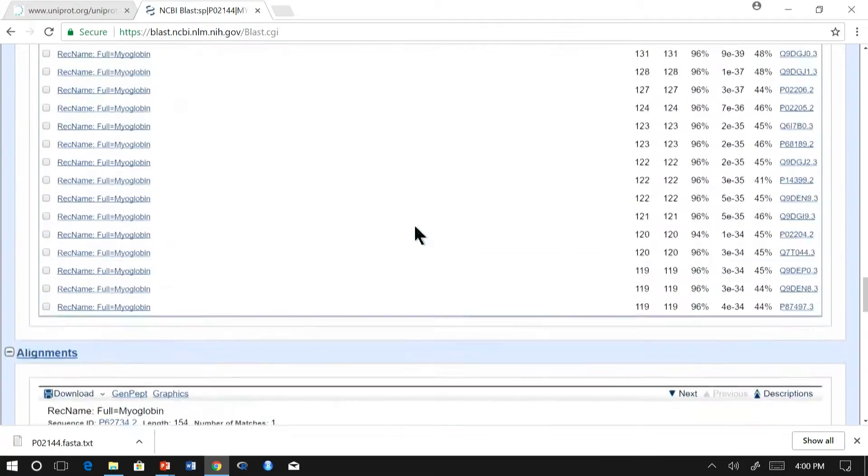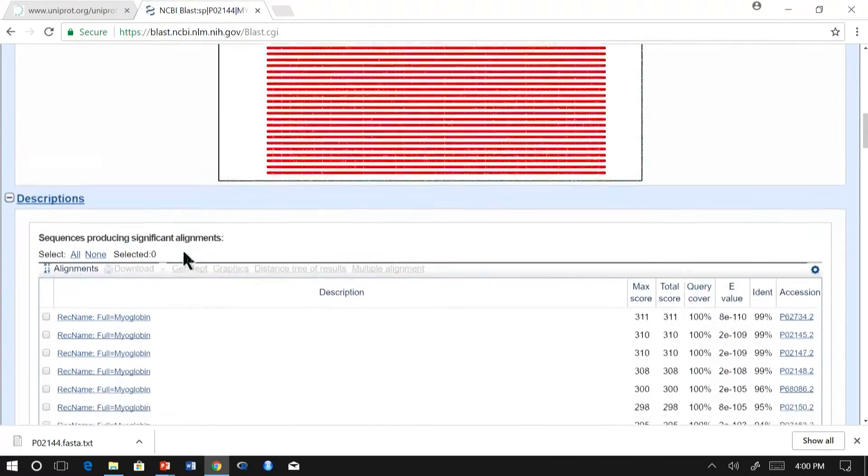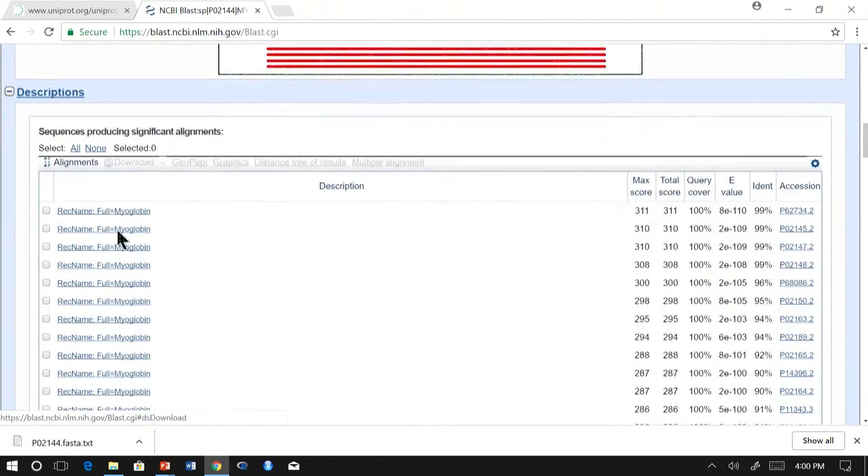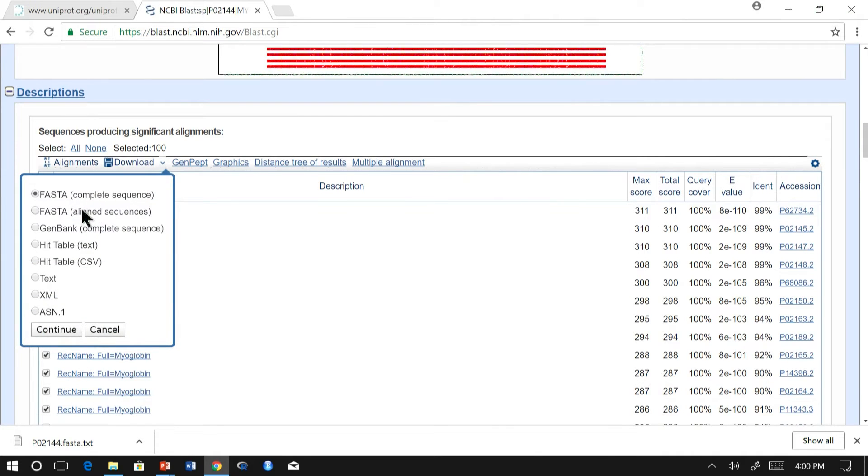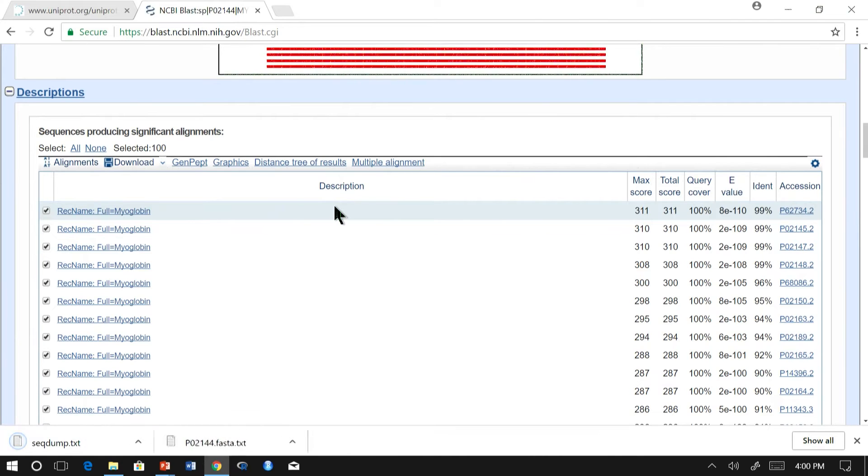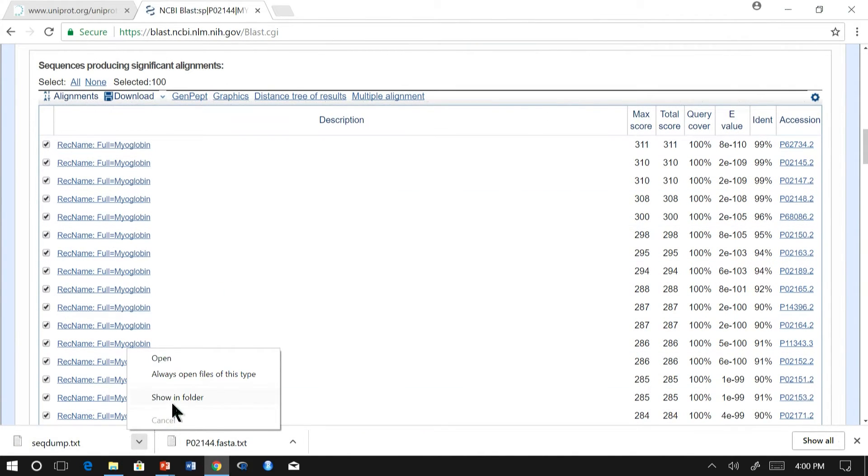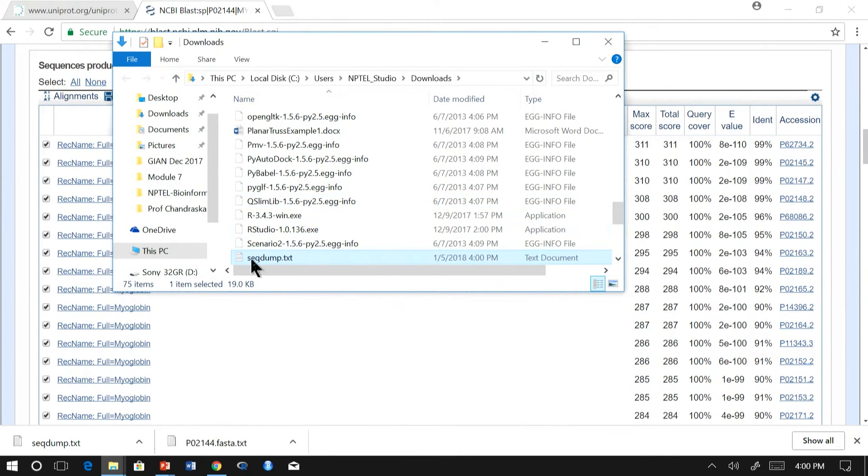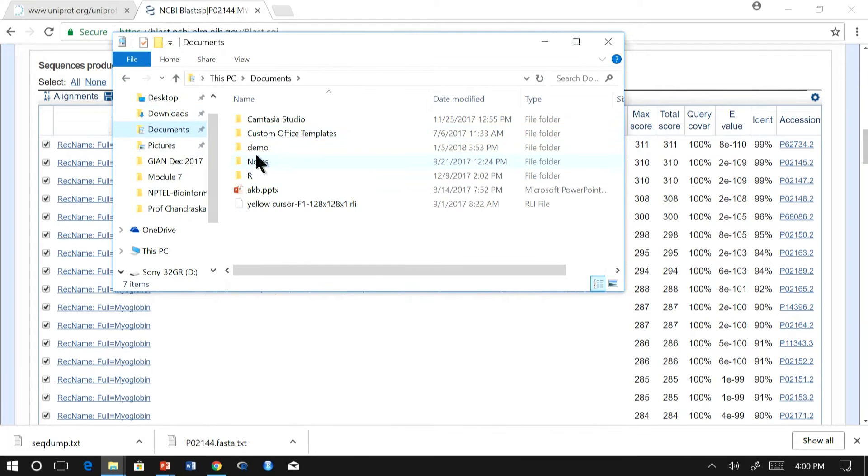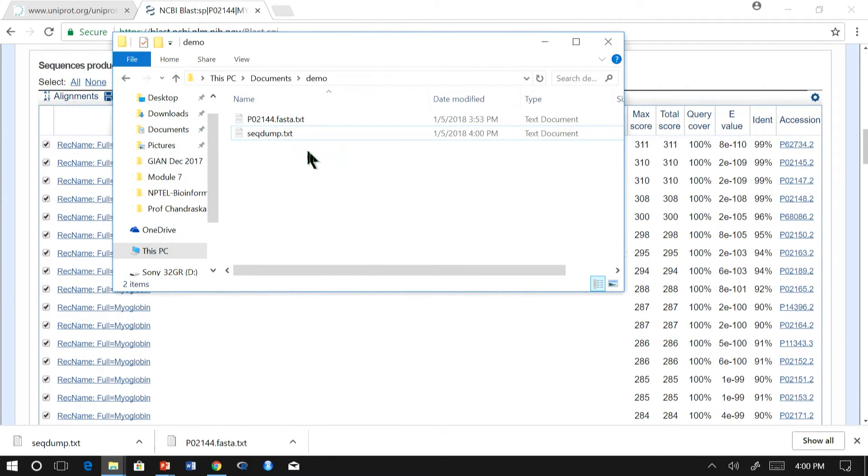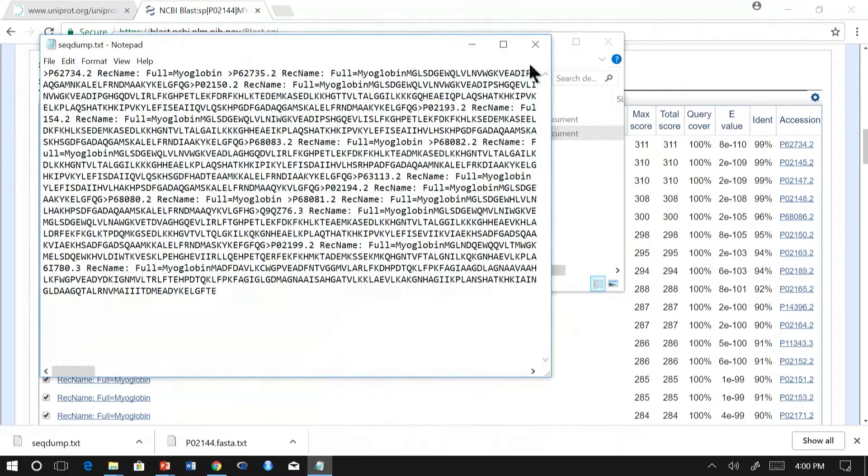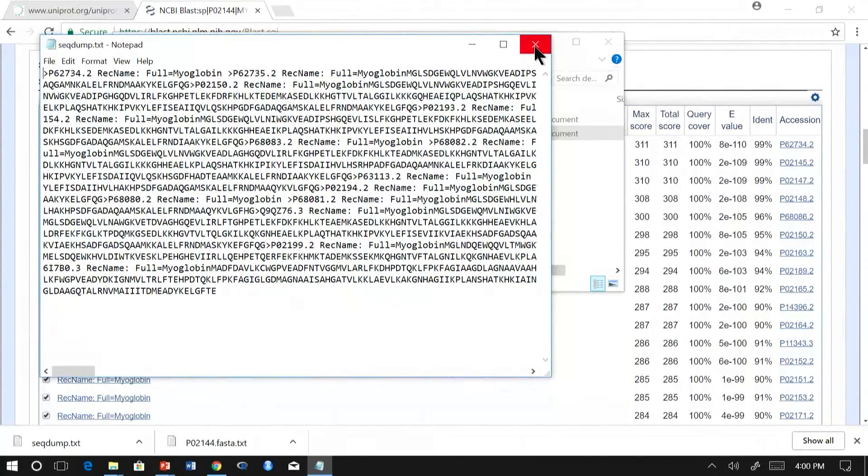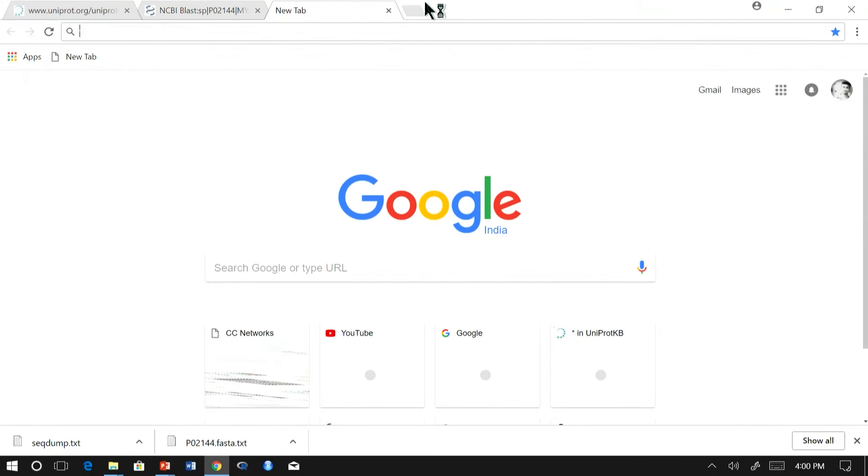Now we will download the aligned sequences. You can download all the aligned sequences by checking all and download to FASTA sequence and continue. So these aligned sequences are downloaded in FASTA format.